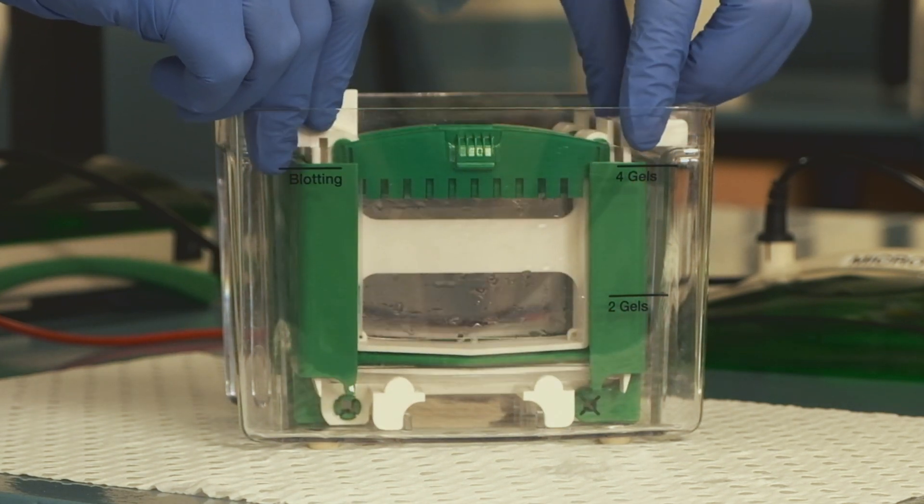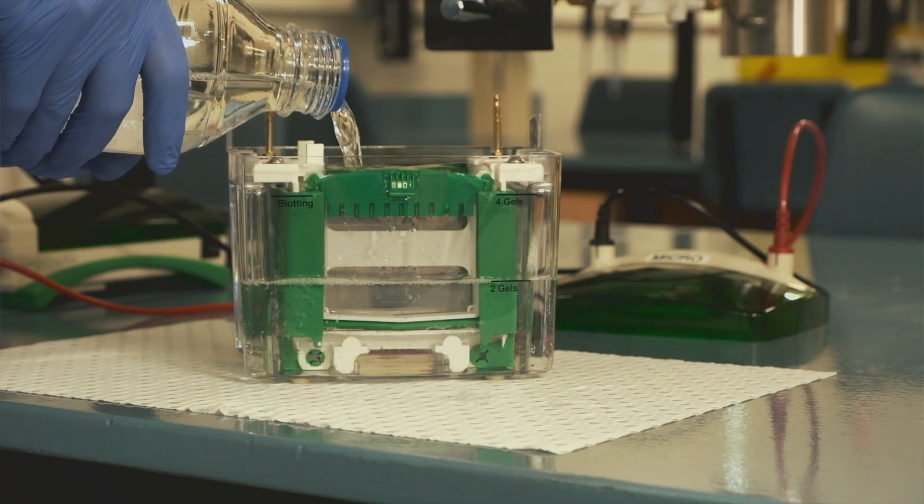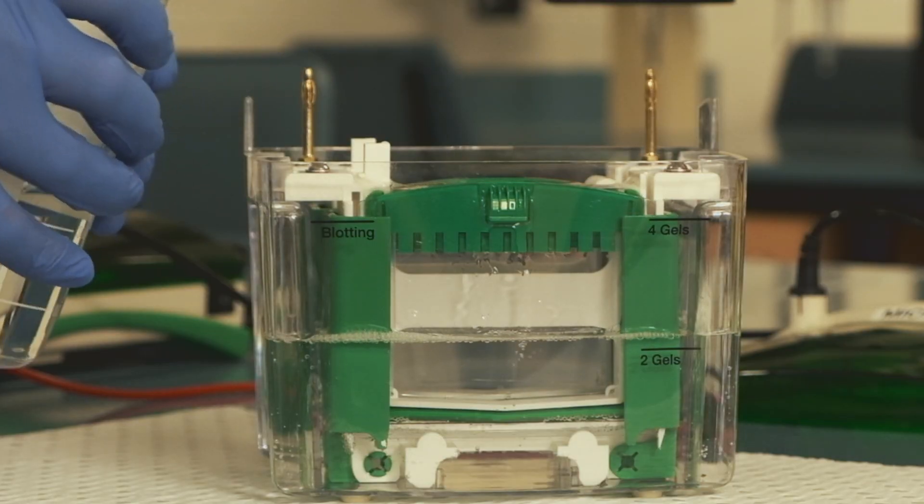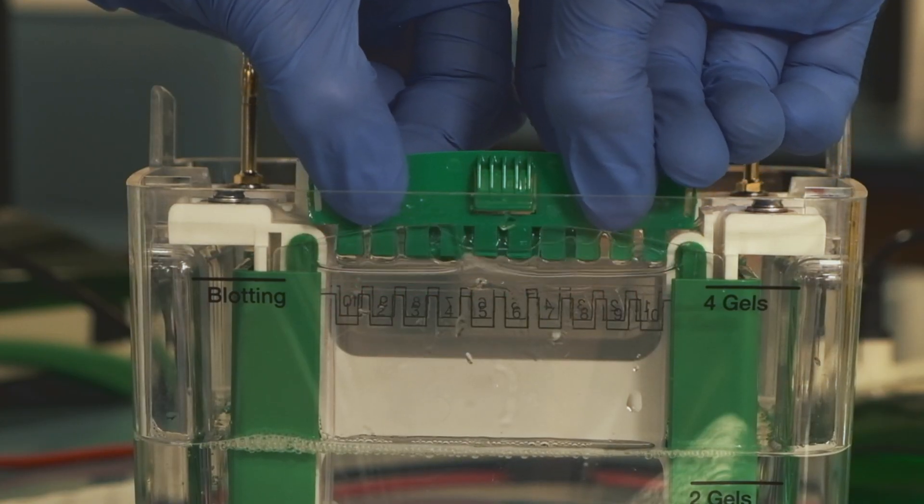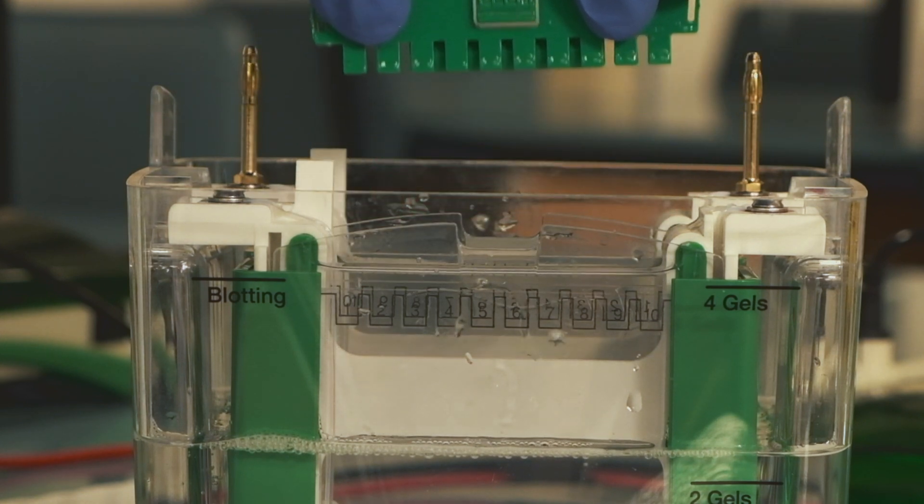The gels are clamped into the holding apparatus, and buffer is applied to fill the inner space and about one-third of the entire tank. The combs at the top of the gel are now removed, making sure that this doesn't damage the gel underneath.